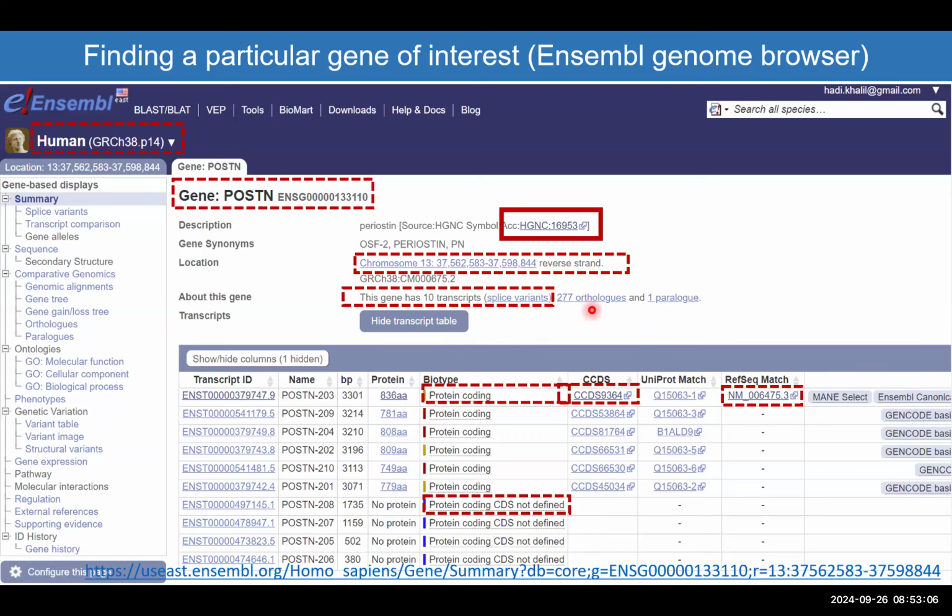It happens to be common with human and other orthologs, like in primates, in fish, in mice, and in many other animals. Now, if we look down, we will see that automatically we got the most common being shifted on the top, because if you look, most of the parameters are known about this.